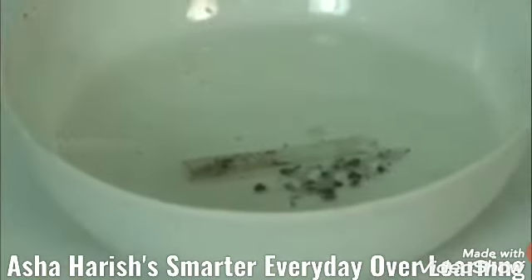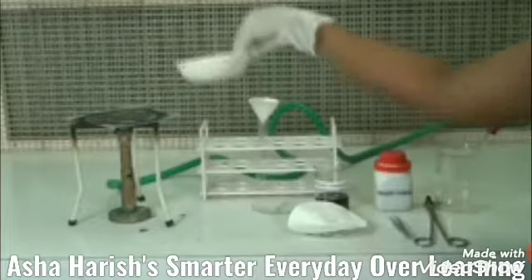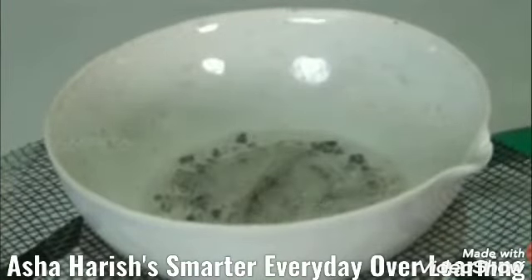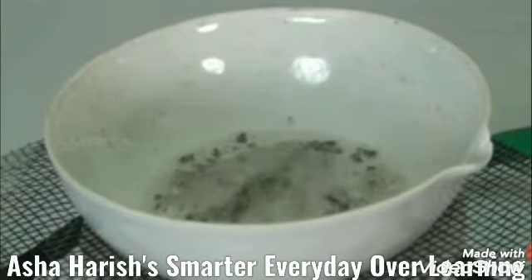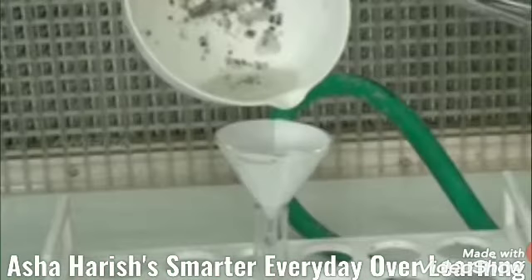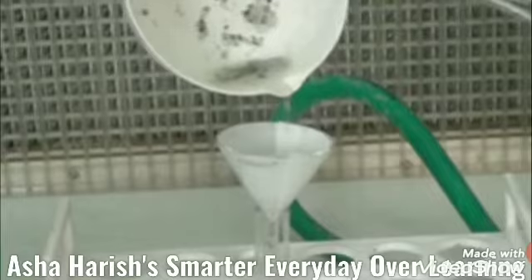Then the hot tube is plunged into a china dish containing 10 to 15 ml of distilled water. Then the contents of this china dish are boiled for a few minutes, then cooled and then filtered. Okay, you are seeing this on the screen. This is the cooling process. Then we have to filter the complete solution into a beaker. Now you get the Lassaigne extract.